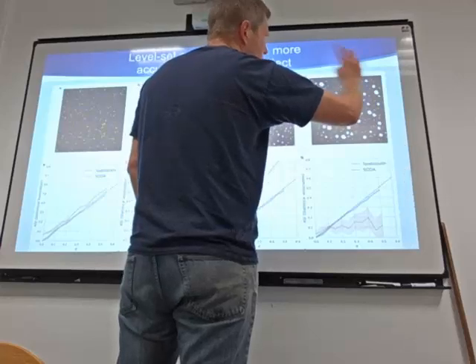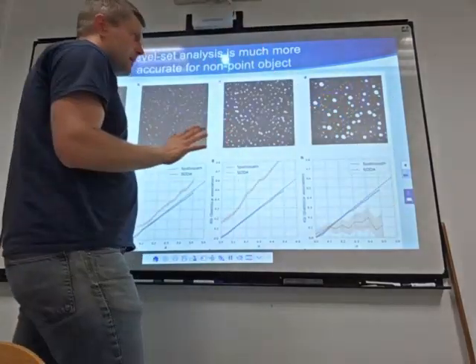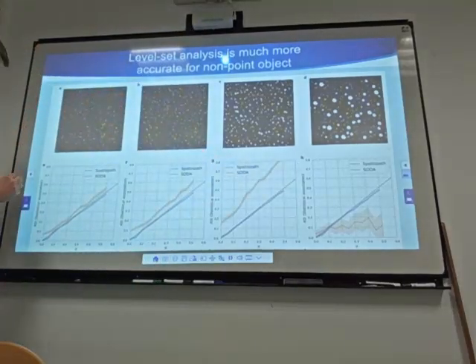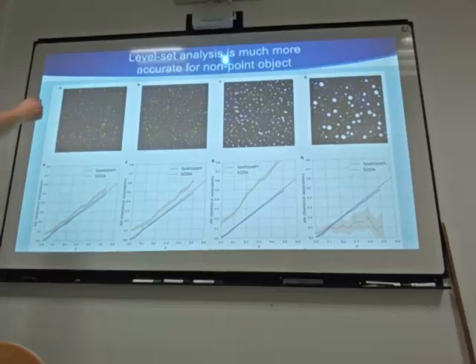I mean, maybe the blue are random and the green are accumulated at some distance from the objects. And we compare, so we simulate a given percentage of accumulation. So what is the percentage of my blue or green objects that are associated to the red? So 0 to 0.6. What is the association I measure?